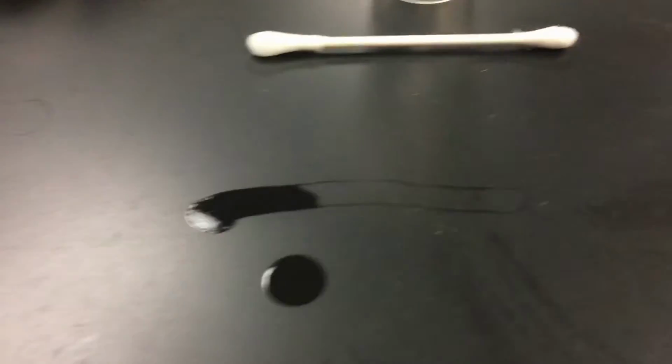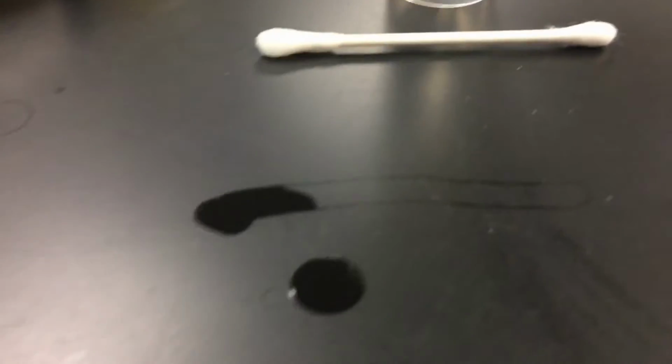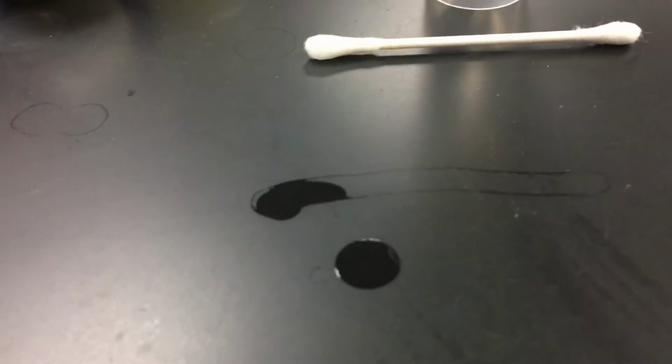In the case of the ethanol, it's a little bit more of an even battle, which is why we don't have as much bubbling up over the surface. The cohesive forces are just about as strong as what's holding them to the table, and that allows them to lay out here. Now our ethylene glycol has not really budged yet. It's still a pretty viscous liquid there. Our ethanol is pretty much gone. And then just to compare, it looks like maybe a little bit has evaporated in this center line here, but otherwise not super exciting.